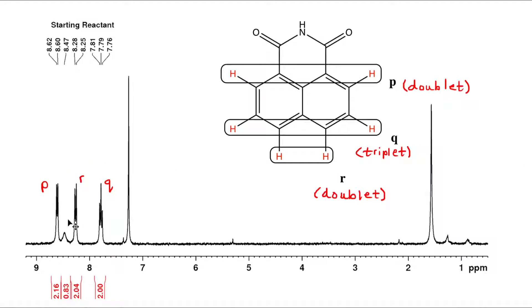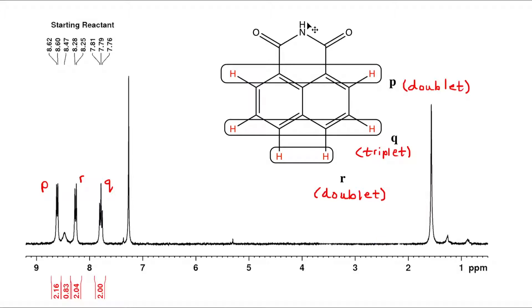Looking at the aromatic region of our proton NMR spectrum, we see signals appearing there — a good sign that we have 1,8-naphthalamide. The integration values for each of the three major signals are approximately two, denoting two protons per signal. The small signal corresponding to the proton on the nitrogen will be ignored, as we want to focus primarily on these aromatic protons.